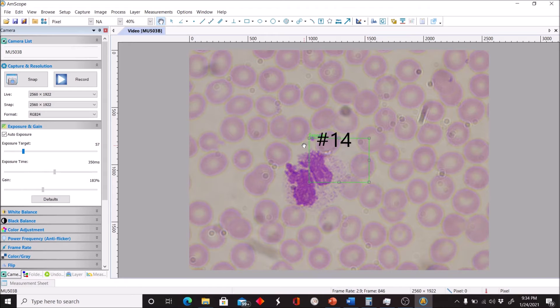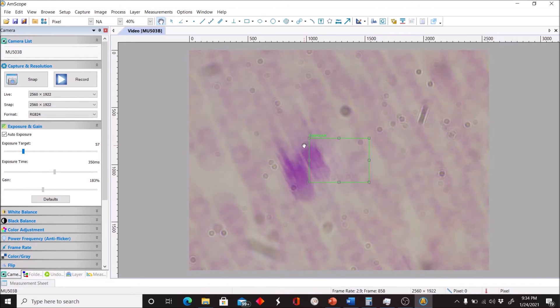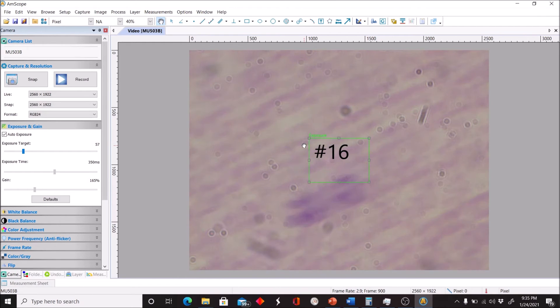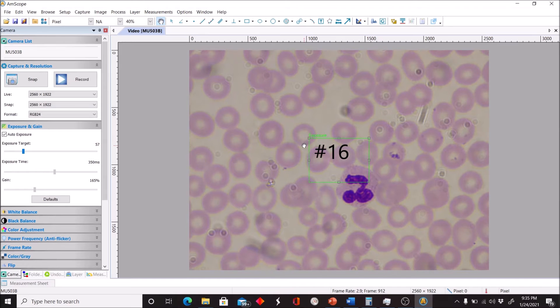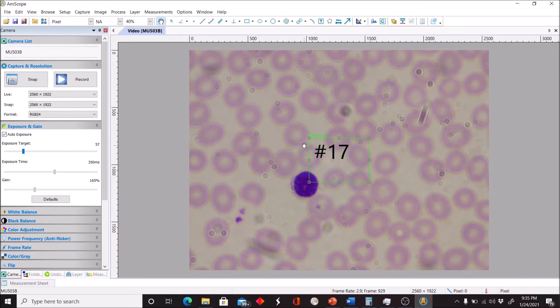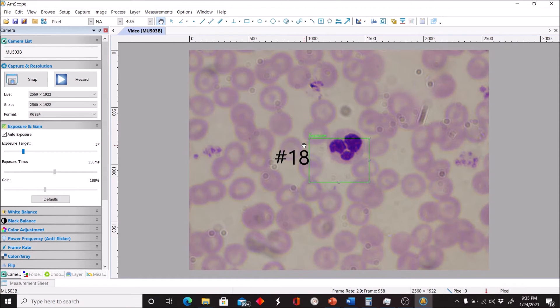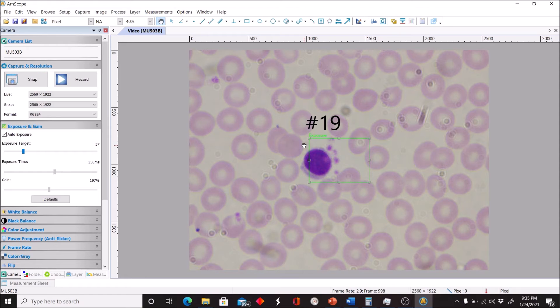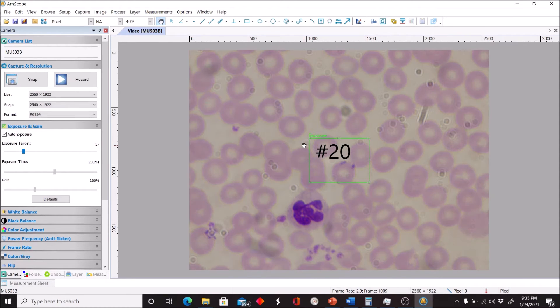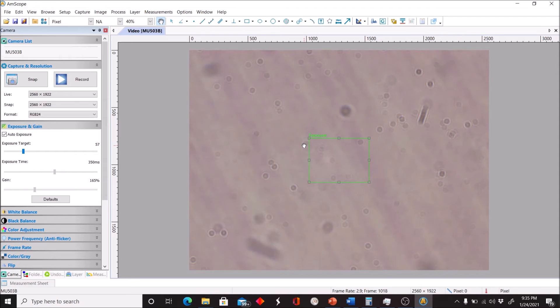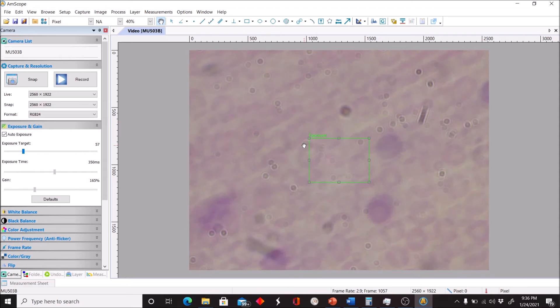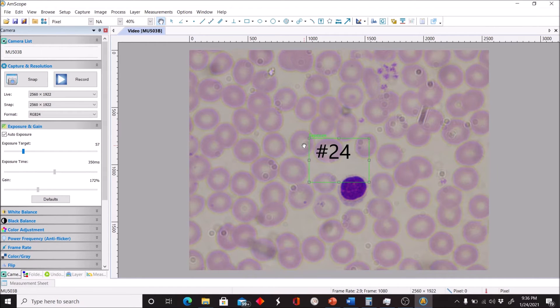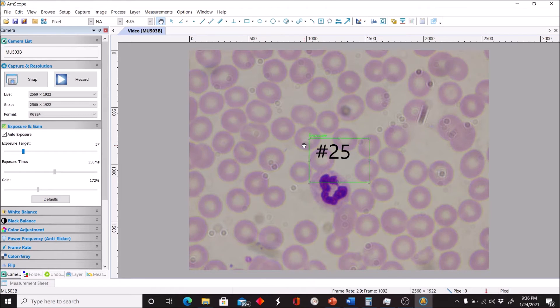That cell should be easy to identify — a little distorted, but no cell gets that big except for one type. Do your best to identify the next cell shown, and then that one as well.